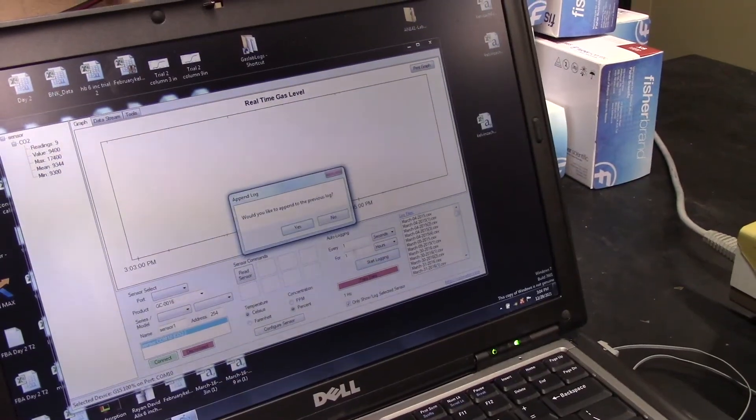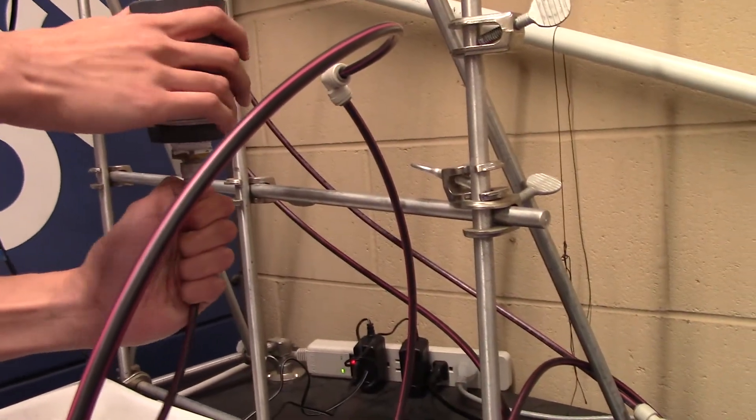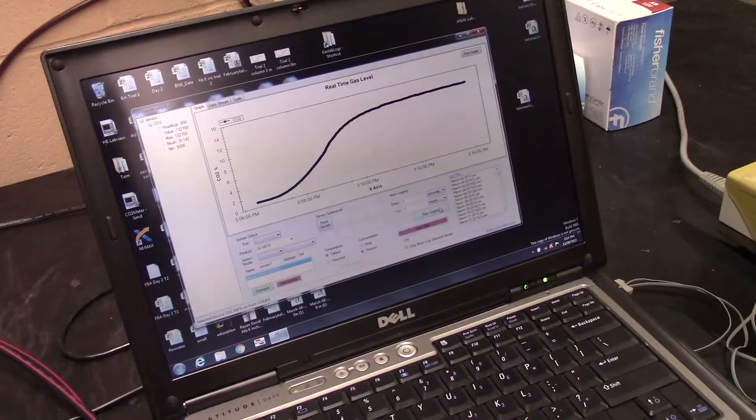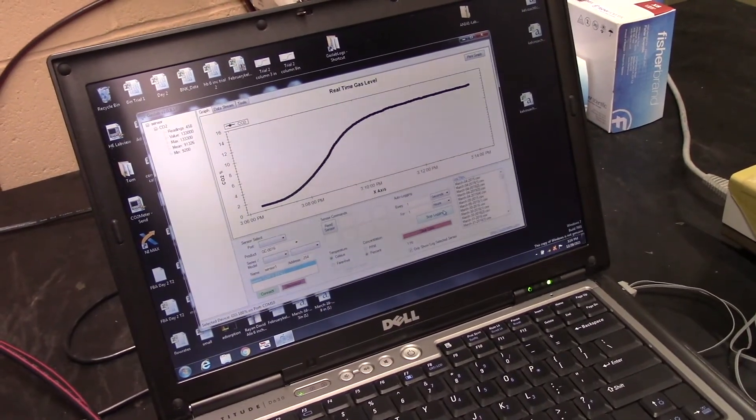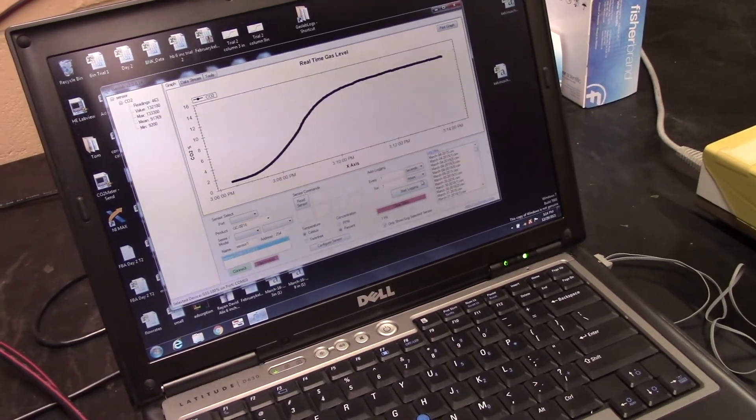In the GasLab software, restart the logging, name the file, hit OK while simultaneously reattaching the bottom tubing to the column to begin collecting adsorption data. Once the concentration reaches a plateau, we can now stop recording data as this indicates that saturation has been achieved.